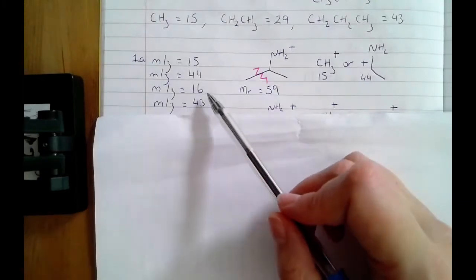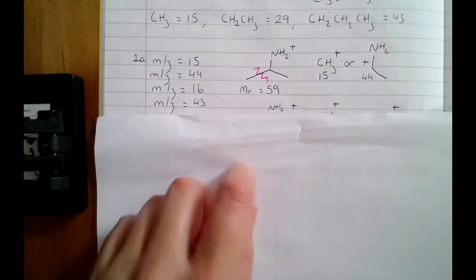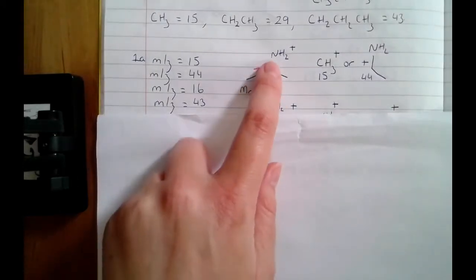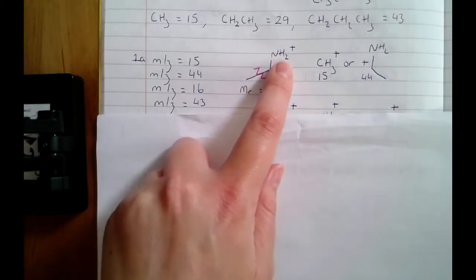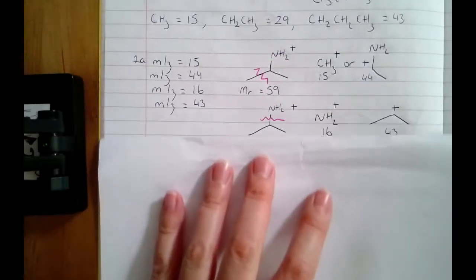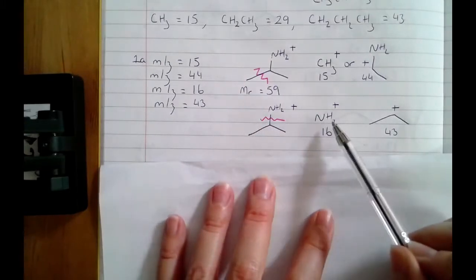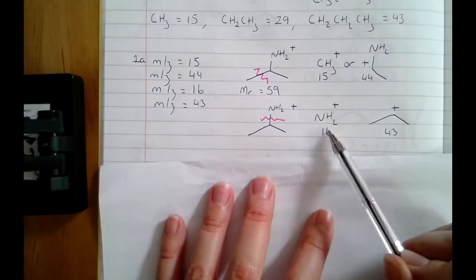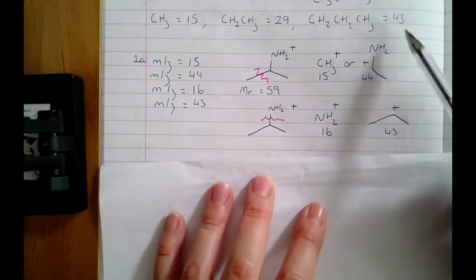If we look at our next fragment, it's 16, okay? So 16 is not one of our common fragments, so you're going to need to have a look and see if you can figure it out from the molecule that you've got. So I'm drawn to the NH2 here, okay? Nitrogen has a mass of 14, each hydrogen has a mass of 1, so NH2 has a mass of 16. That means if I were to break this bond here, I would end up with an NH2 fragment with a total mass of 16, and I would end up with a C3H7 fragment with a mass of 43.